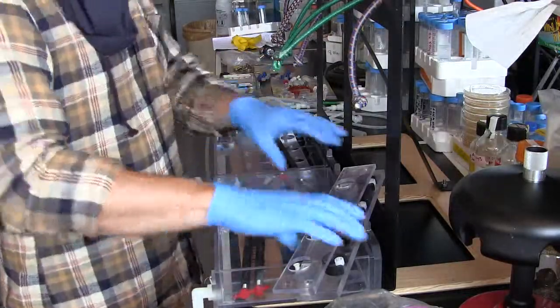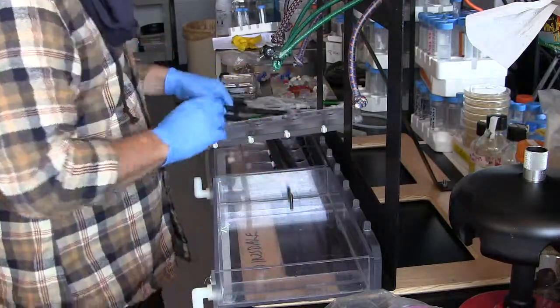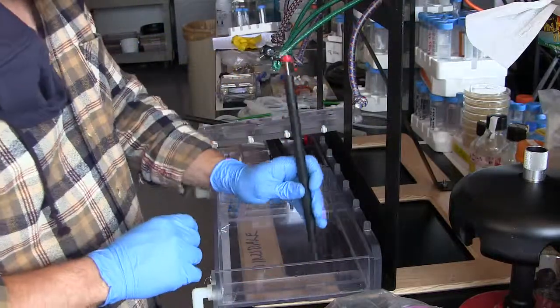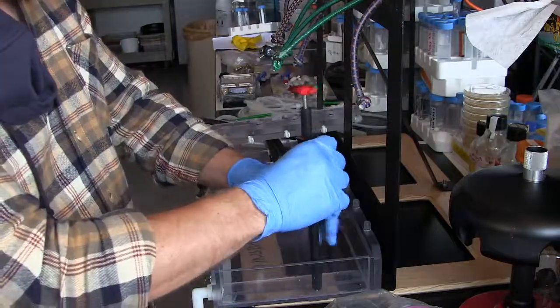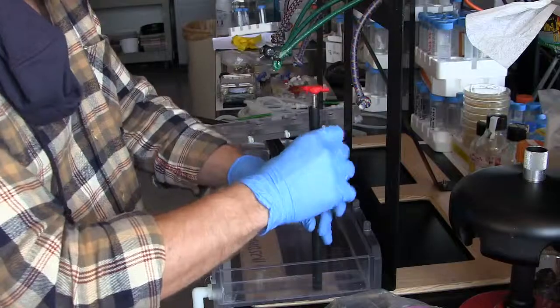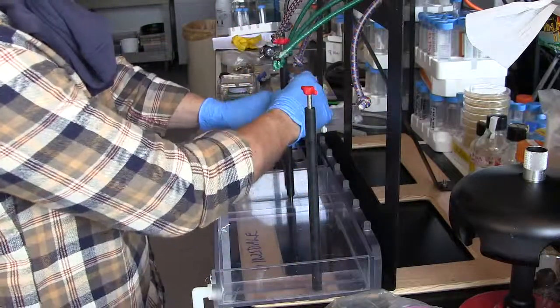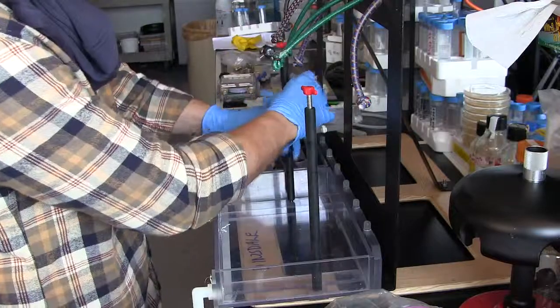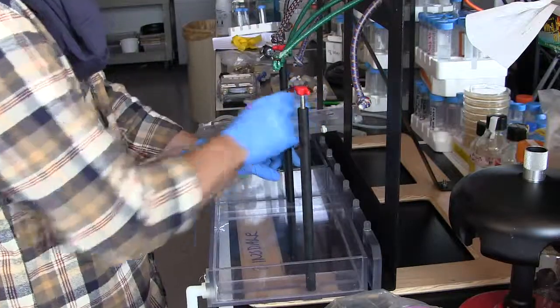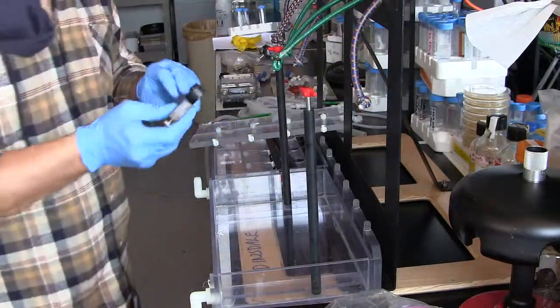Okay. Now the way we set these up is this. There's a stock part over here. Okay. The first thing you want to do is you take the pole and you screw it into these little holes that are found down here on the side of the basin. So screw that in here. This one goes in here. Okay, beautiful.